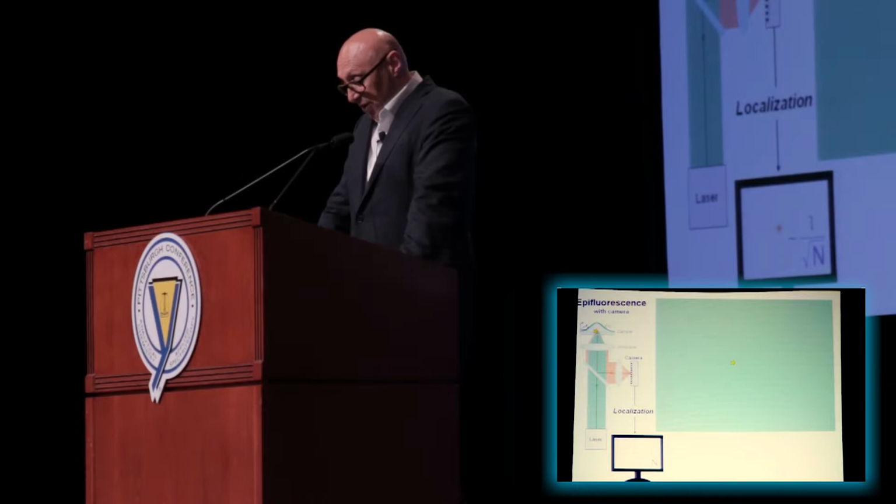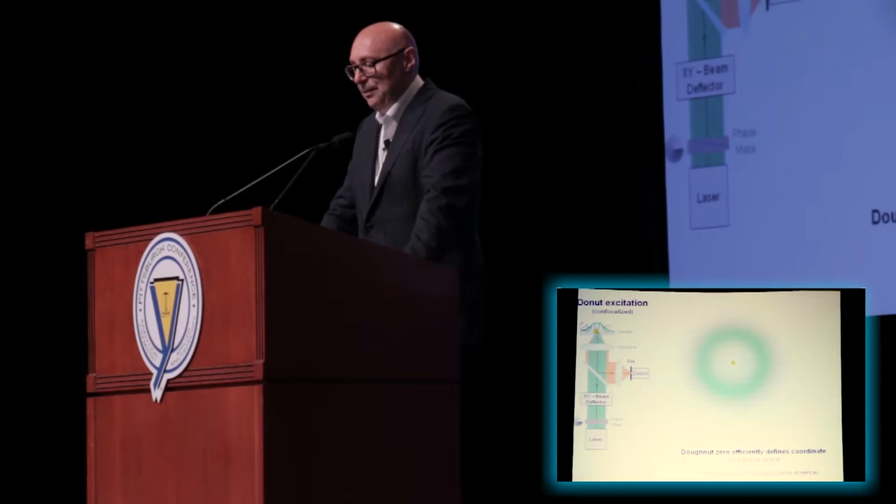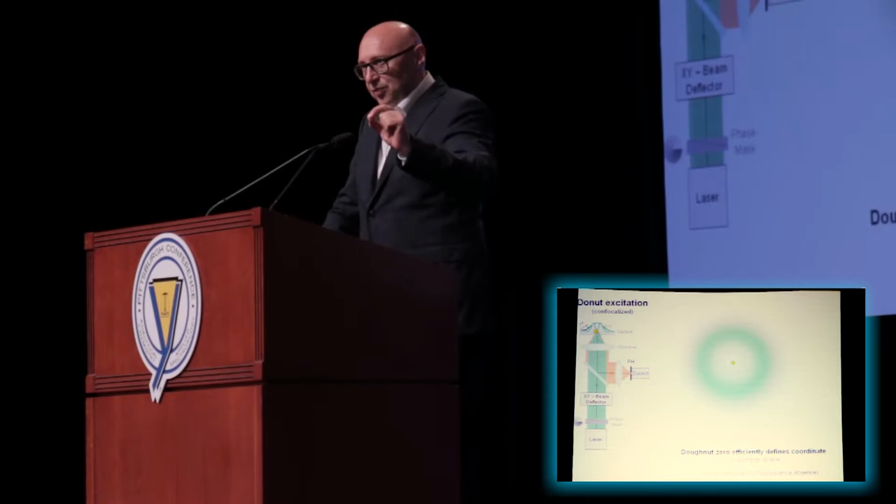Now, if you do it like this, of course, you fully rely on the number of emissions, and there's no way out. It also has some other issues about orientation of the molecules, but that's a detail you may not be interested in. So, as I said, we're now combining the strengths of STED with the strengths of using single molecules.